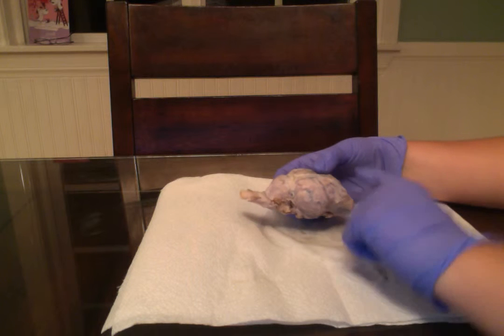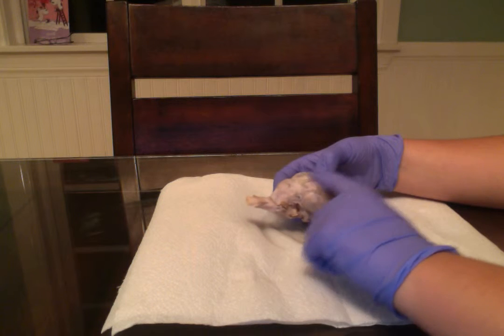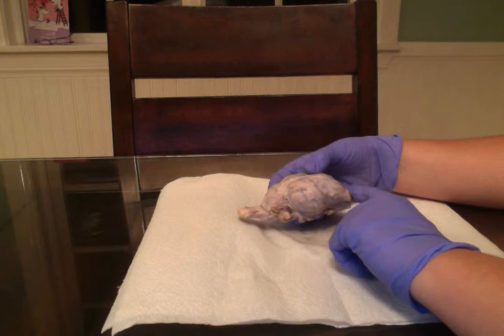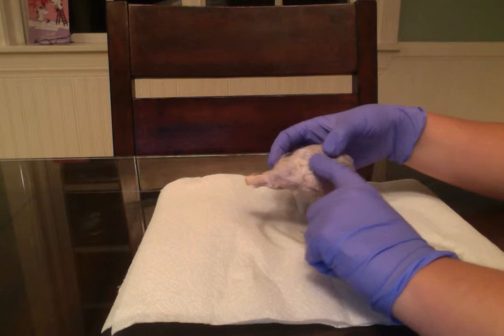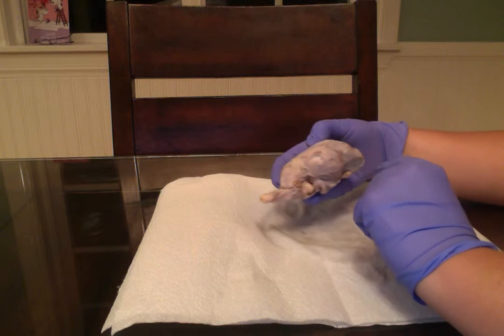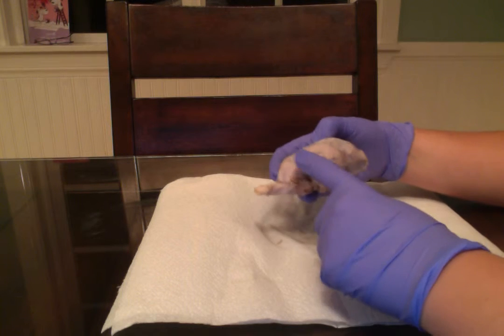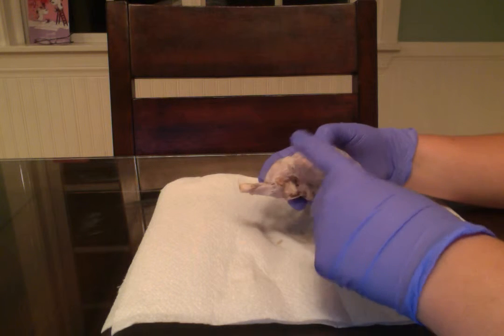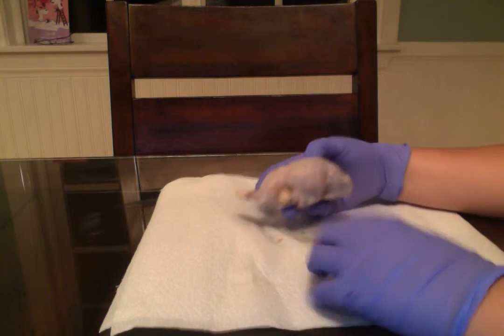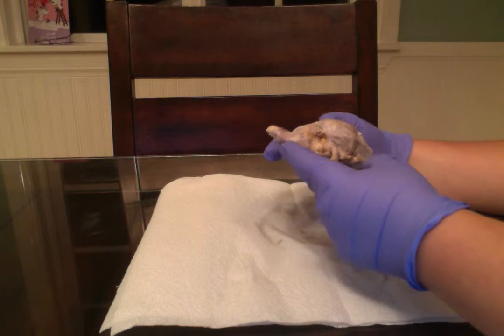We are also going to see the gyri, these elevated ridges of tissue, and they are separated by shallow grooves called the sulcus. We also have the longitudinal fissure, and that separates the left brain from the right brain. We also have the lateral sulcus, and that separates the temporal lobe from the parietal lobe. We also have the cerebellum, the pons, and the medulla oblongata.